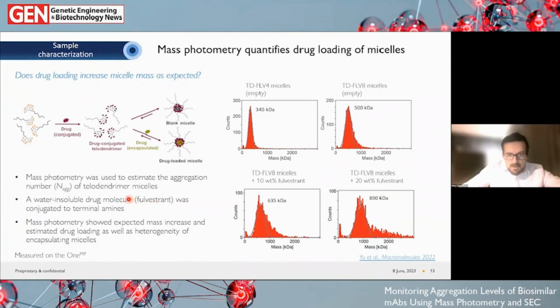The group in question were interested in using mass photometry to study these micelles in a little bit more detail, and to assess how well the micelle has loaded with the drug of interest.